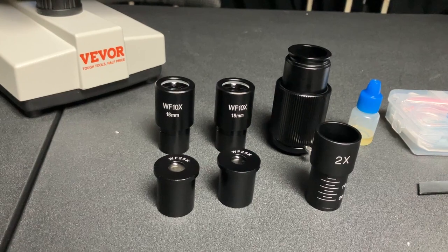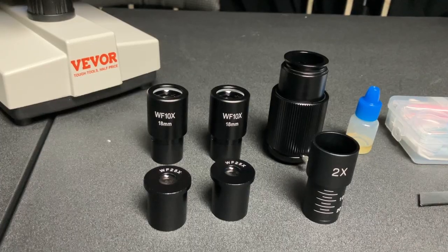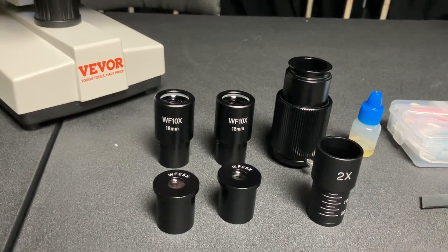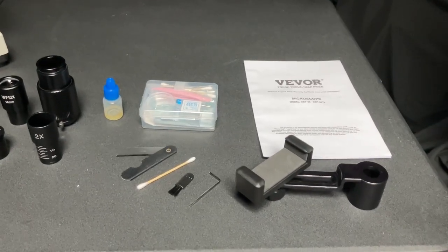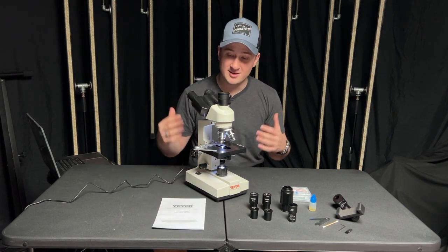So here's a quick shot of everything you get in the microscope kit including the microscope itself plugged in and powered on as well as all the different magnification lenses and adapters, the phone mount, the accessory kit. Again, I'm not an expert in any of this but do check out and consult the manual as that's going to help you a ton.